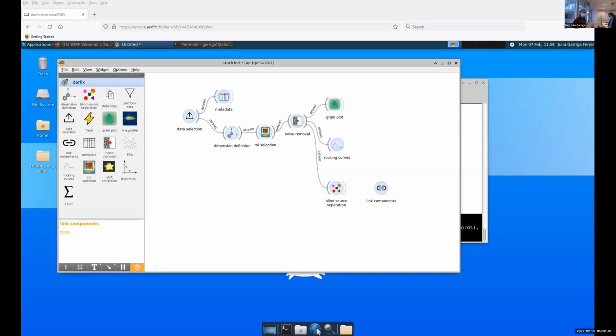In 3D XRD, there are some limitations. There's a double filter: you go to a certain position in your sample, you find a grain that diffracts in a particular direction, and most likely the grains around it diffract in different directions that are not very clear. Sometimes it's interesting if you have two that are sufficiently close, because then you can study the grain boundary between both. But normally we take one grain at a time.